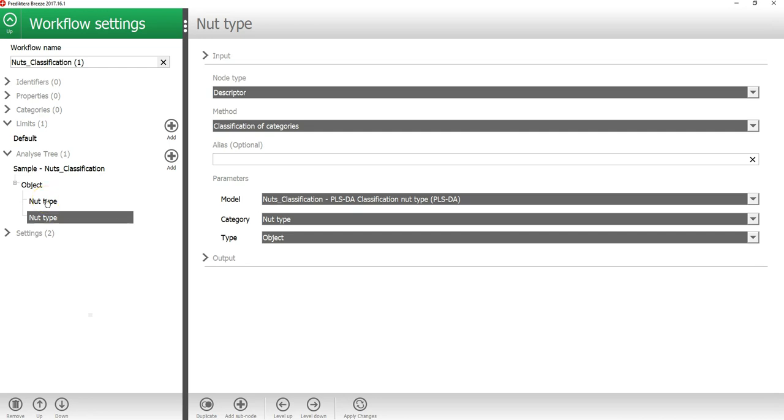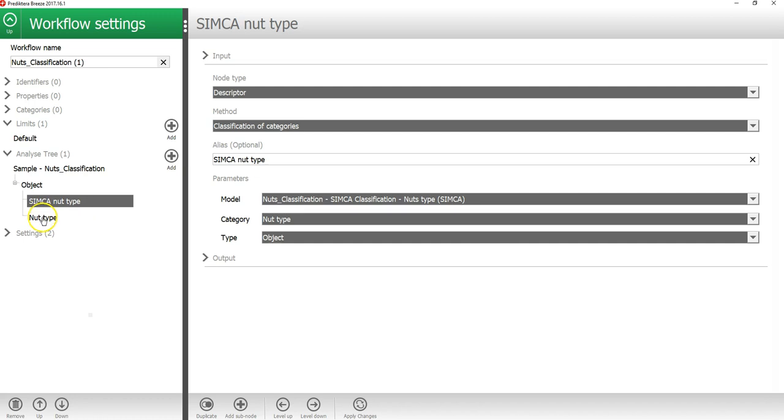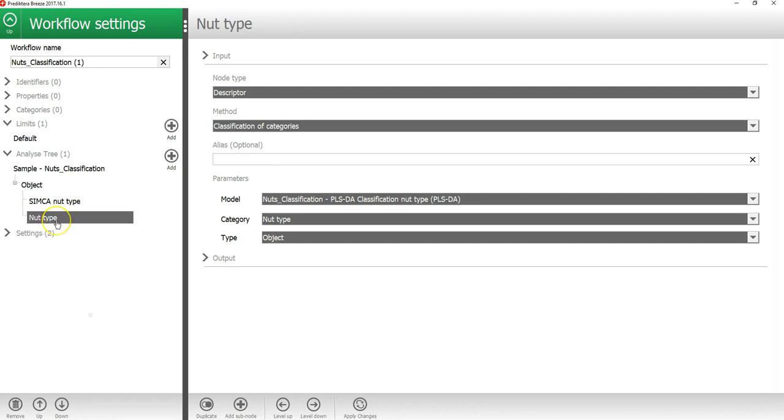If I click on the first nut type model, I can see that this descriptor is using the Simca model. In the alias field, I will then write Simca nut type. I will then click on the second nut type descriptor and this is using the PLSDA model. So I will call that PLSDA nut type.